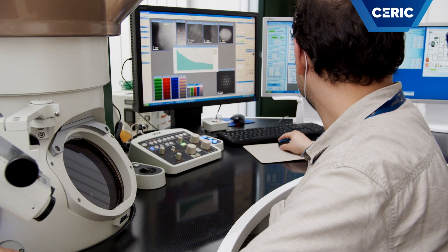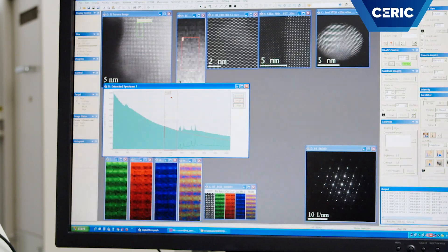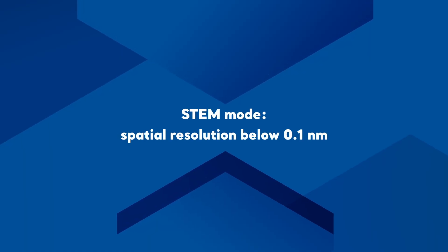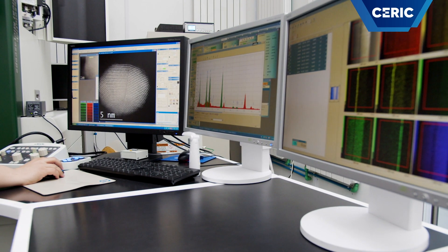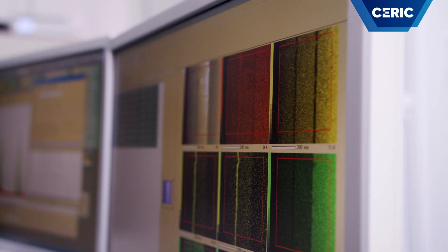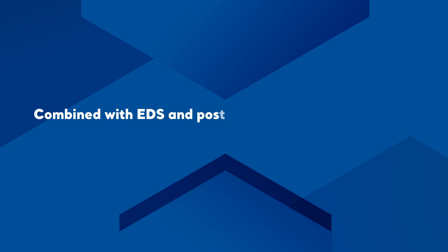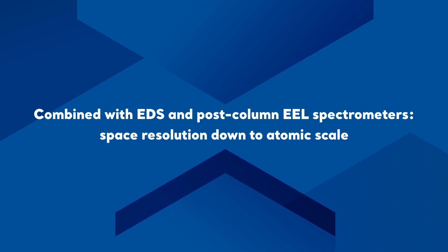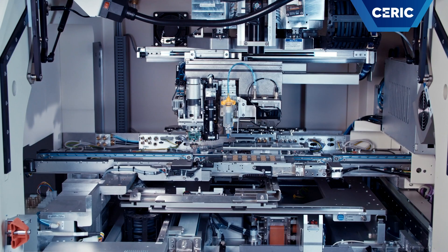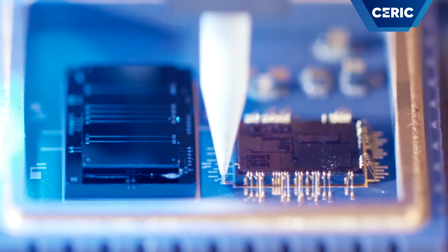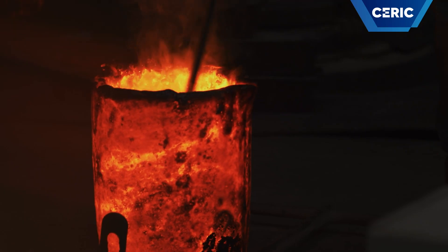The scanning transmission electron microscopy mode is available at a spatial resolution below 0.1 nanometers due to a spherical aberration corrector inserted in the microscope column. Combined with the EDS spectrometer and the post-column EEL spectrometer, we are able to obtain local chemical and structural information with a space resolution down to atomic scale. Considering the atomic resolution imaging capabilities and the analytical techniques available on our complex instrument, we are able to perform advanced microstructural characterization in a wide range of research domains, from nanotechnology, including nanomaterials and thin films for microelectronics, to metallurgy, ceramics and other complex materials for nowadays applications.